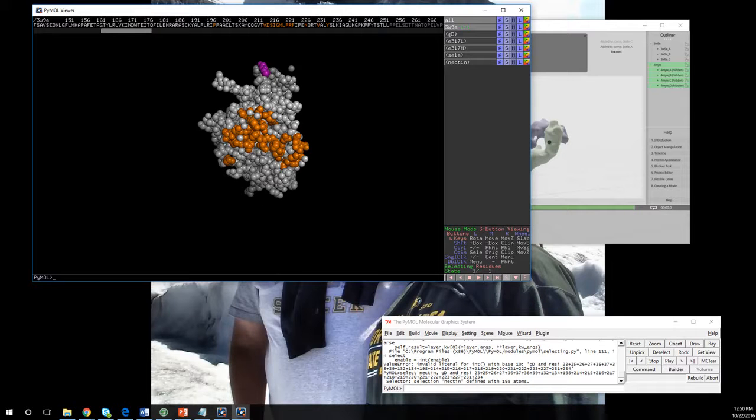This just gives me a frame of reference for where I am on the molecule. So it'd be like walking up to a globe of the Earth, and you're looking at it from the Australian side, and you're like, what is this? So this just kind of flips it over and gives me a frame of reference to where things are going.